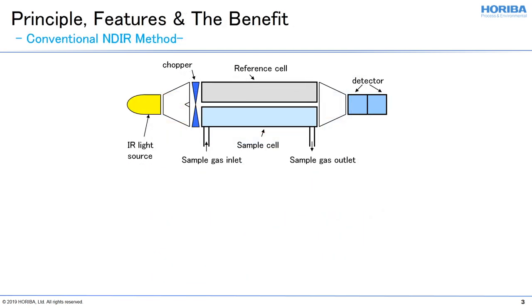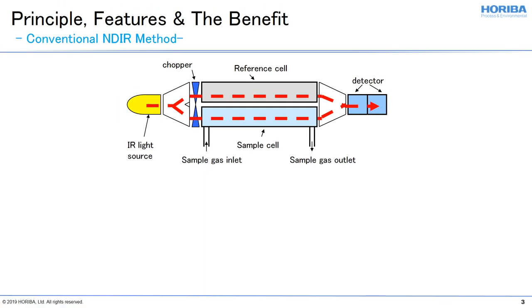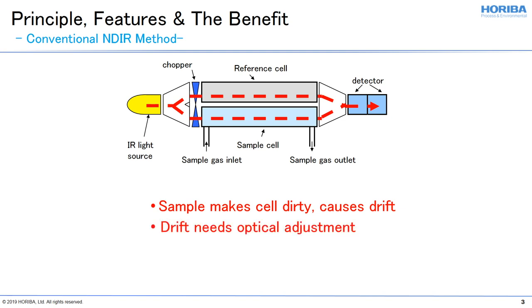A method was developed to overcome the issues associated with light detection and sensitivity. The improvements included one light source, one detector, and two cells. This technique splits the light beam. Unfortunately, the issue of dirty sample gas entering the sample cell still exists and optical adjustments are still required. Also, the light needs to be split equally in half, and vibration can cause problematic measurements that must be adjusted by a skilled technician.